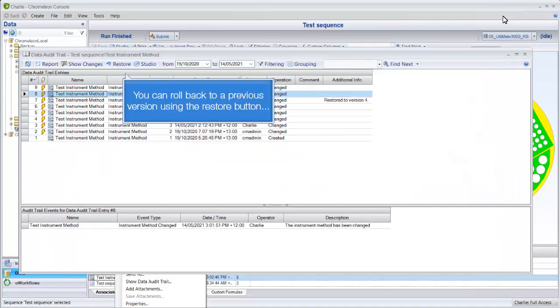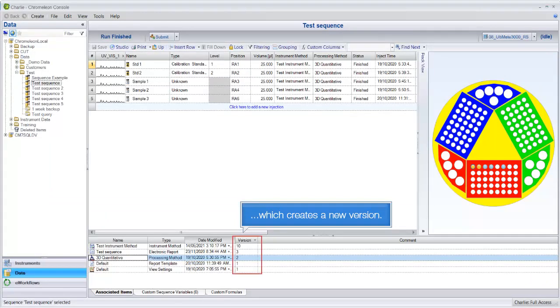You can roll back to a previous version using the restore button, which creates a new version.